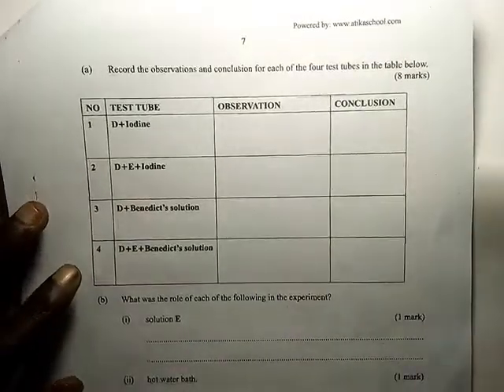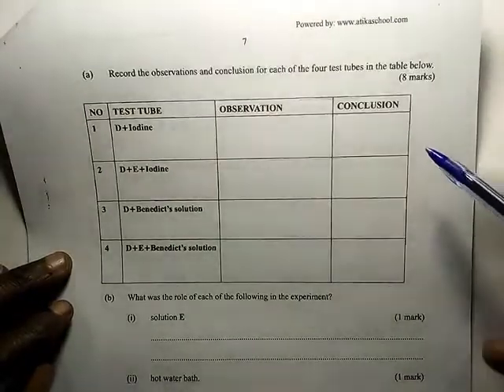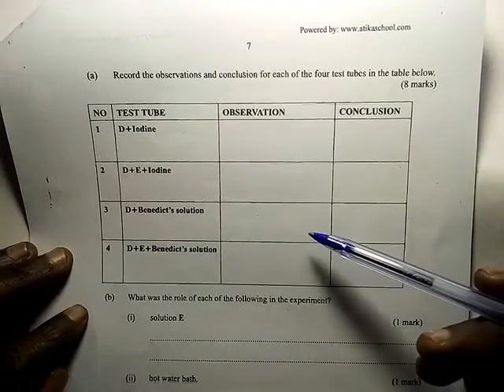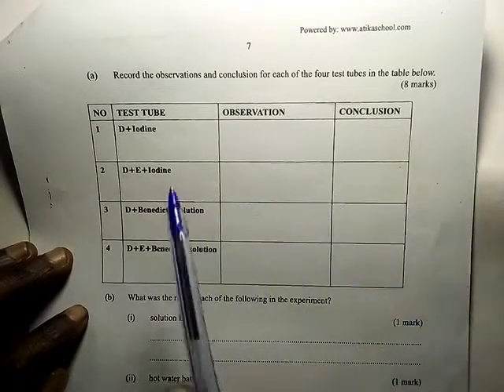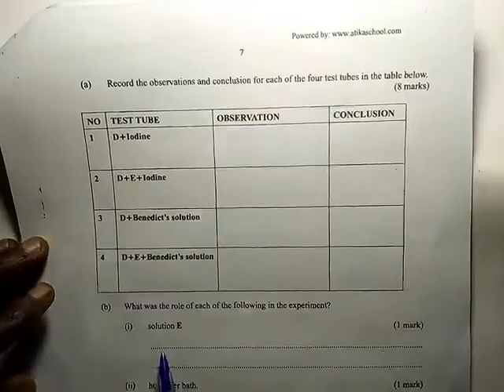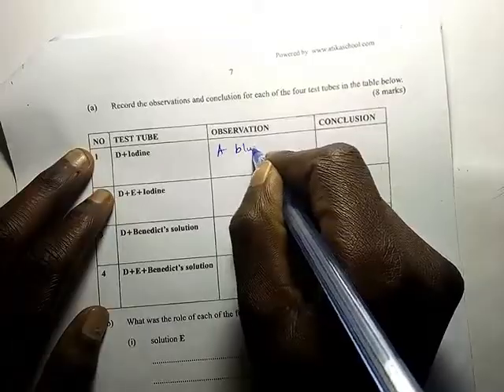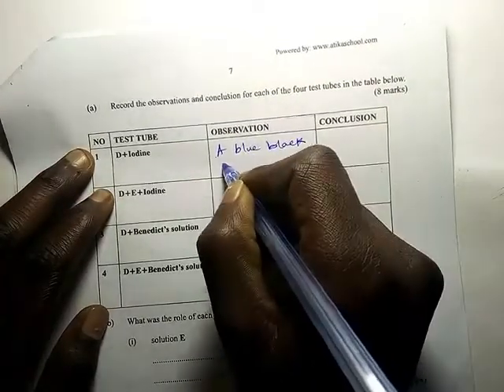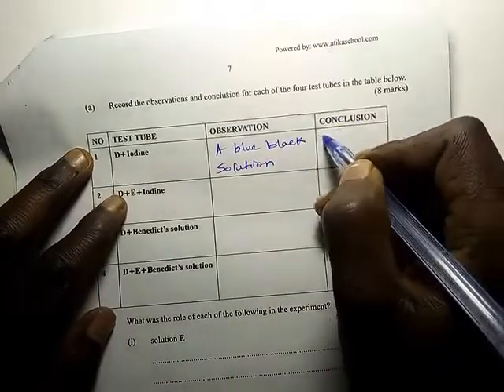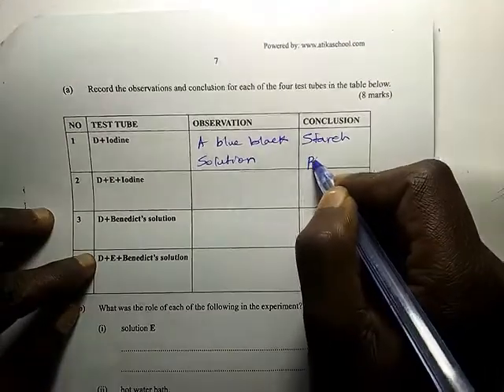A student is able to know what is being tested because you have been given starch, iodine and reducing sugar, and Benedict. Therefore, students should be able to understand it is testing for reducing sugar and starch. After test tube 1, as he was instructed, the observation should be that a blue-black solution is observed. Now the conclusion automatically is starch present.